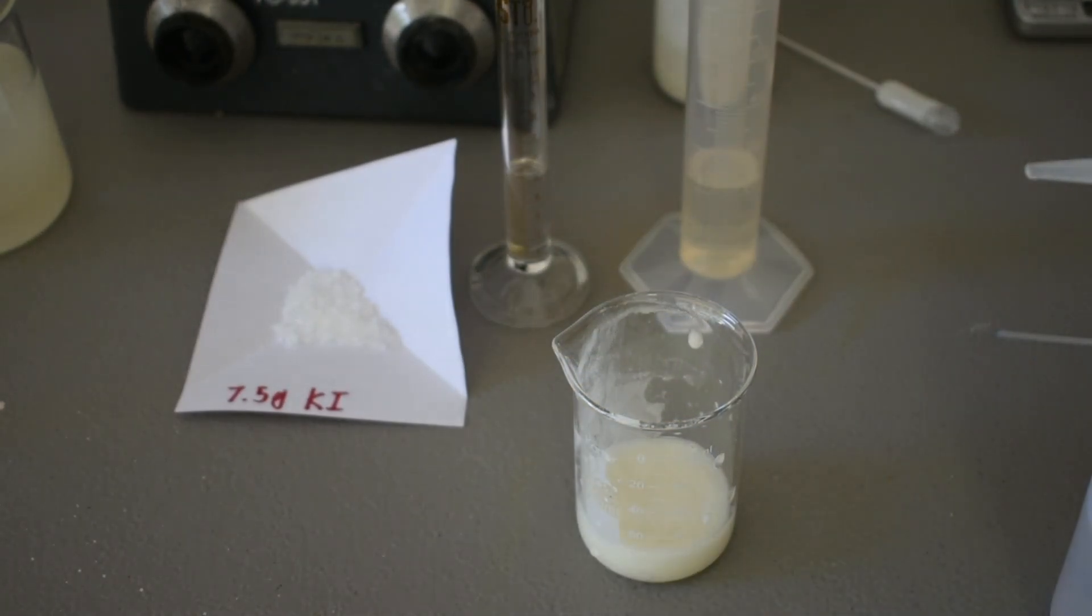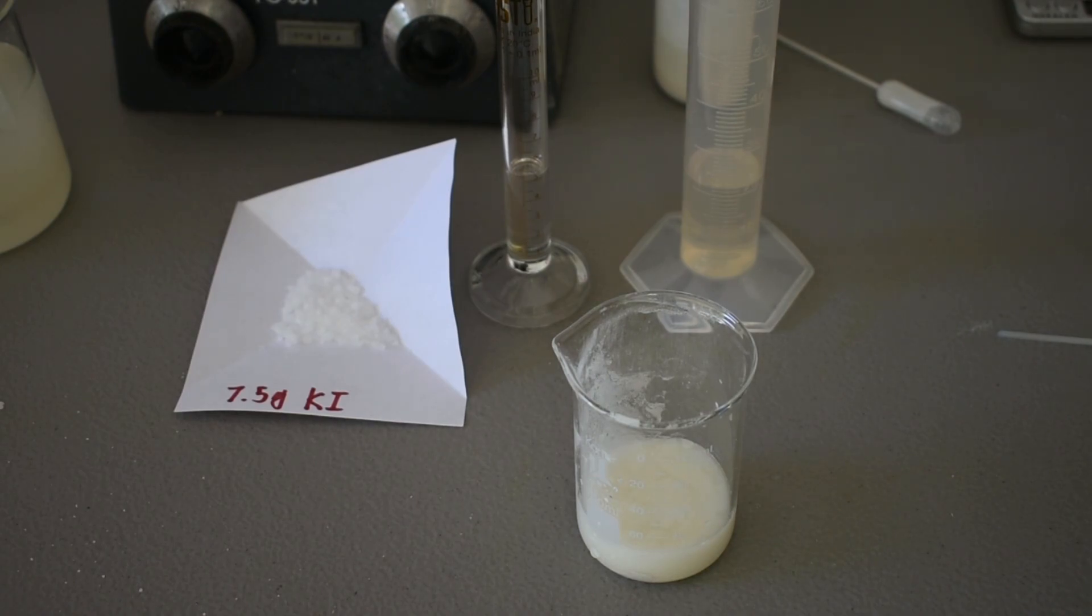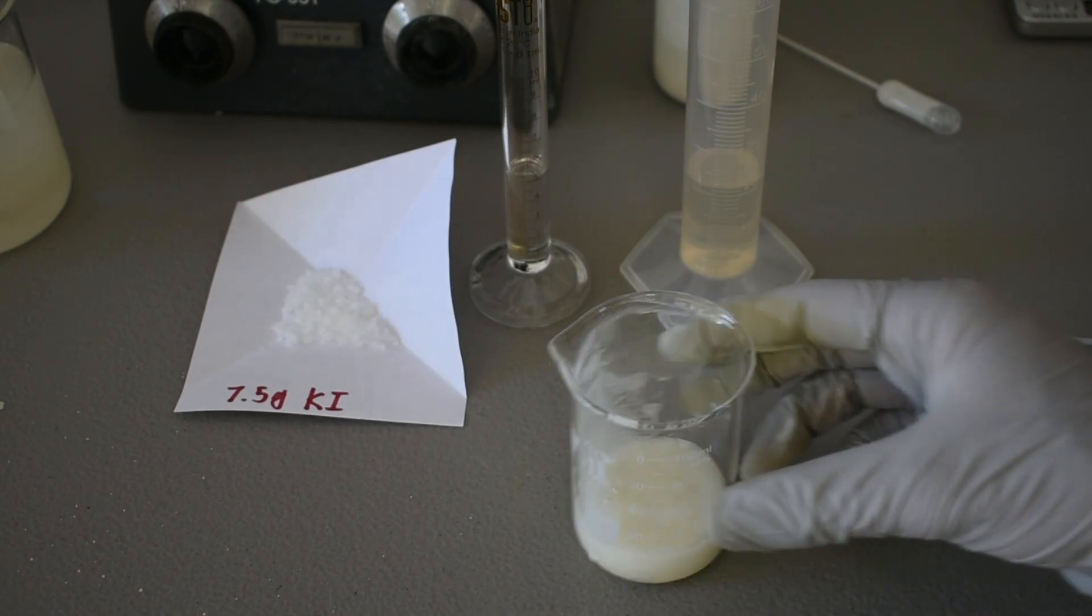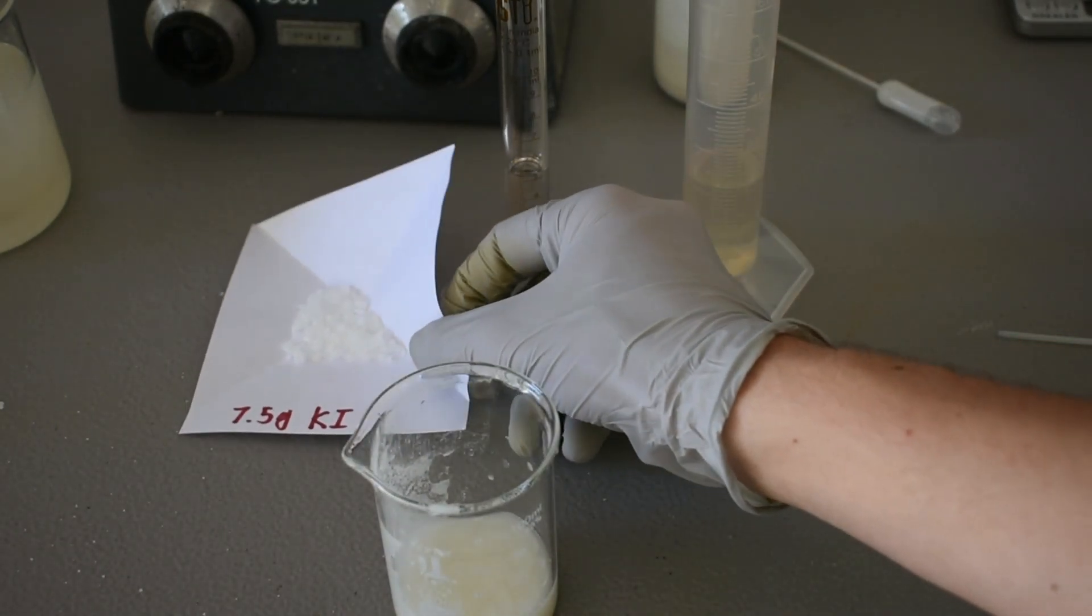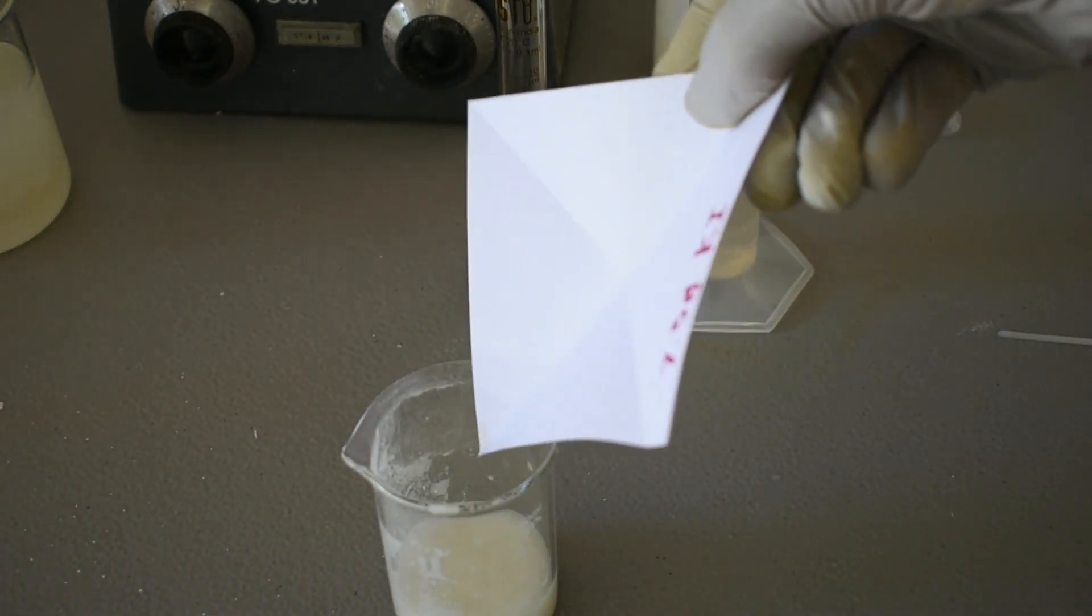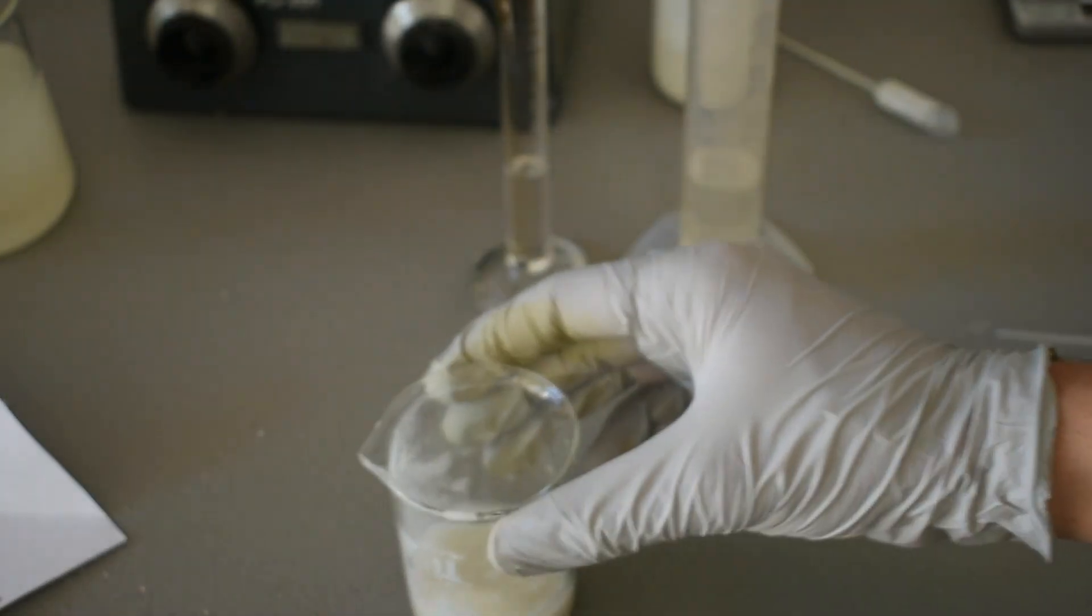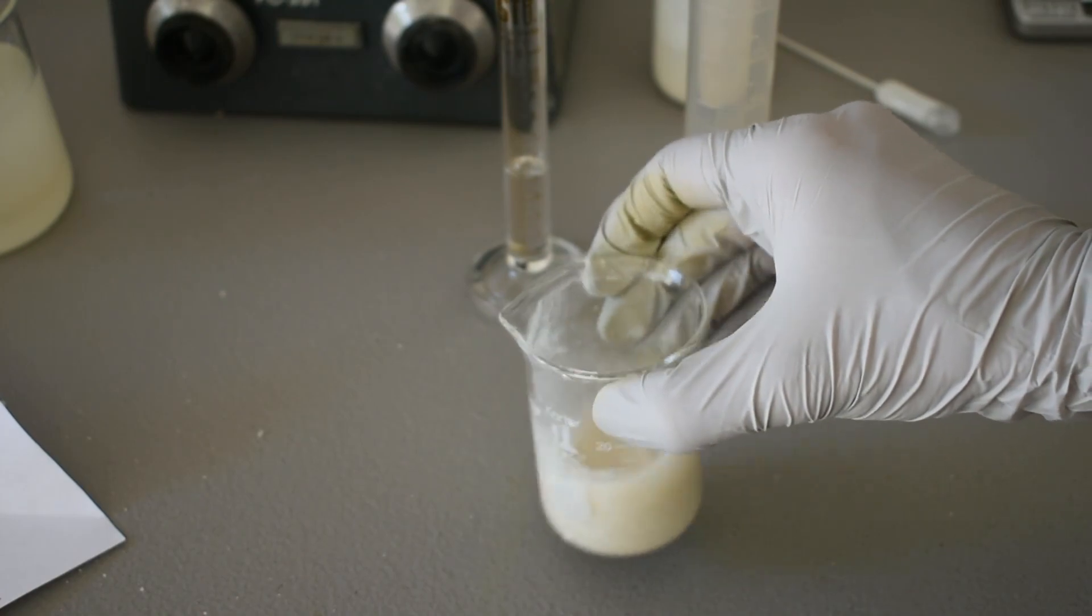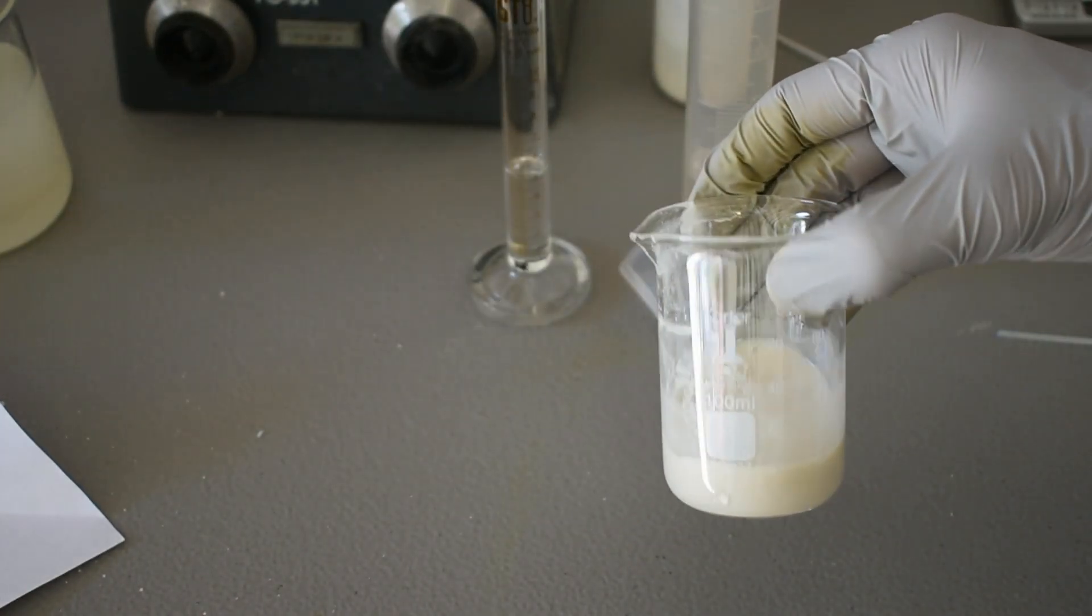Let me get this dirty filter paper out of the way. So now we have another suspension of copper iodide. Five grams of copper iodide in 25 milliliters of water. And what we're going to do is add our potassium iodide to this as well. Here's our seven and a half grams. I'm going to swirl this around so everything's suspended.